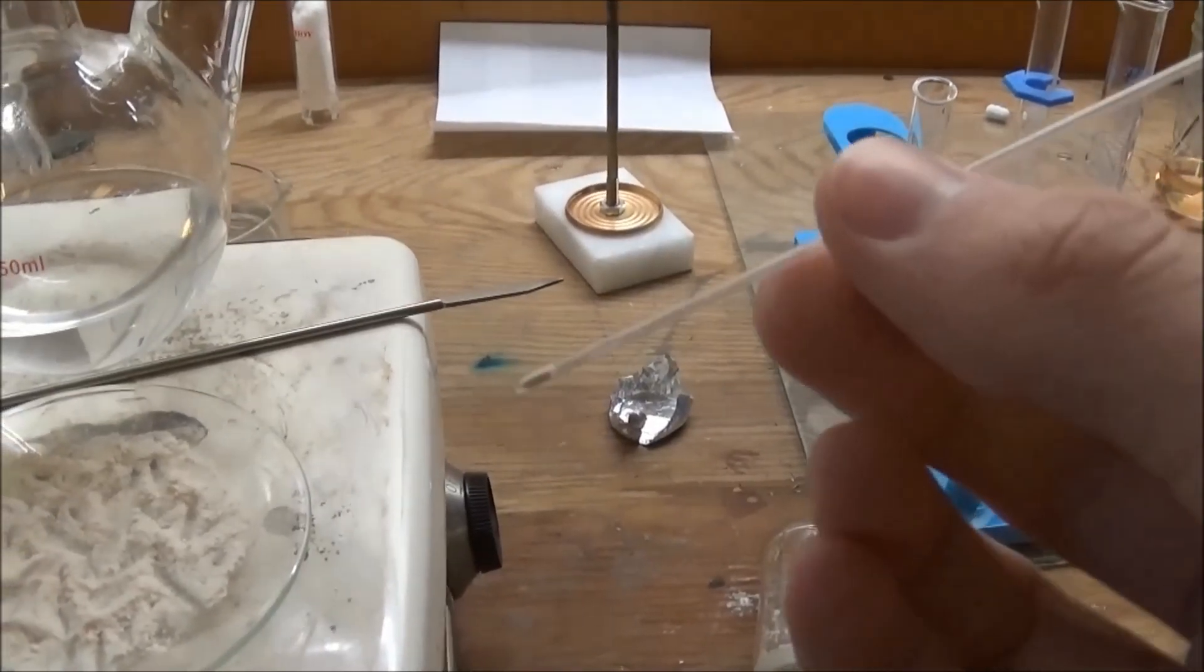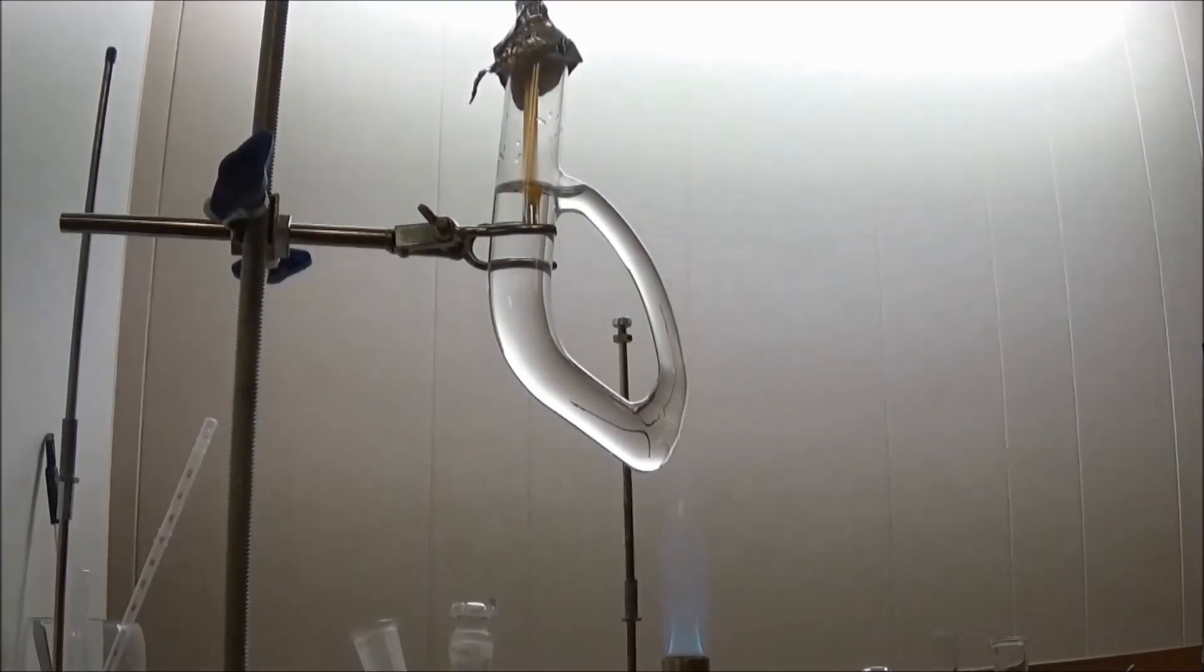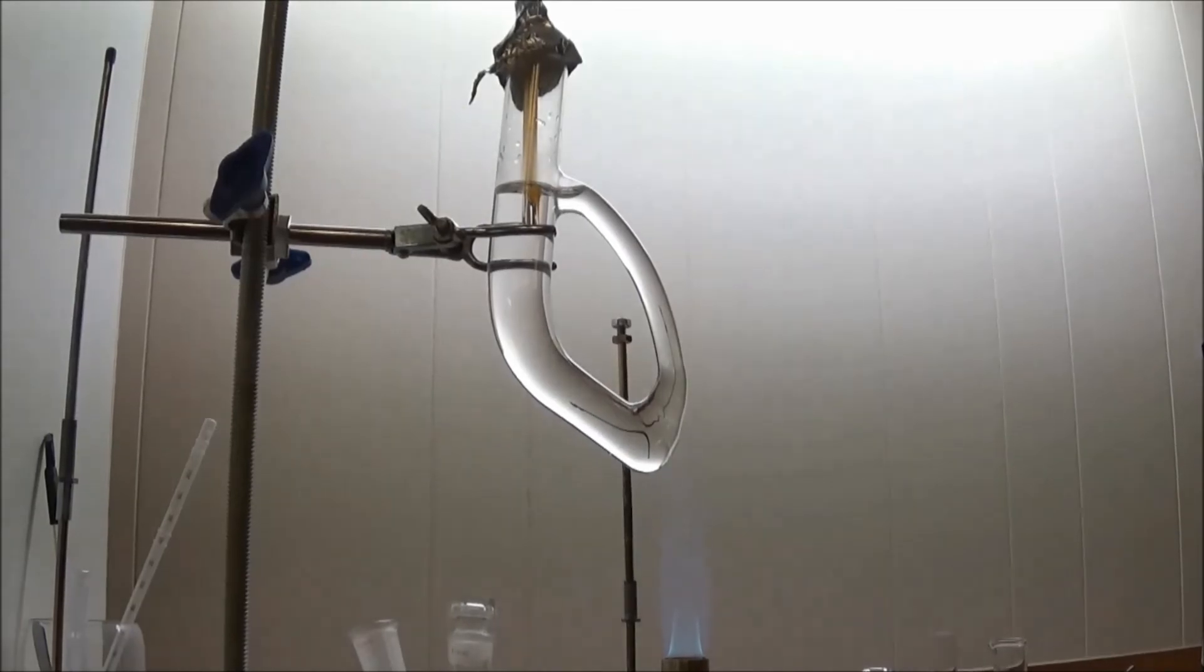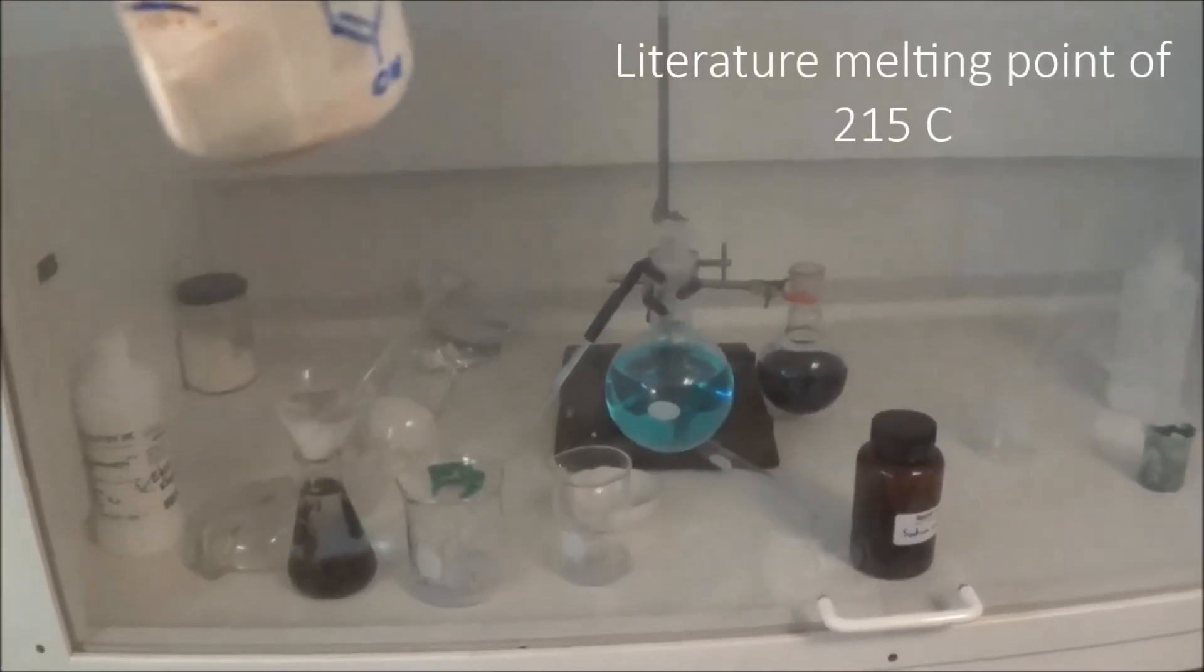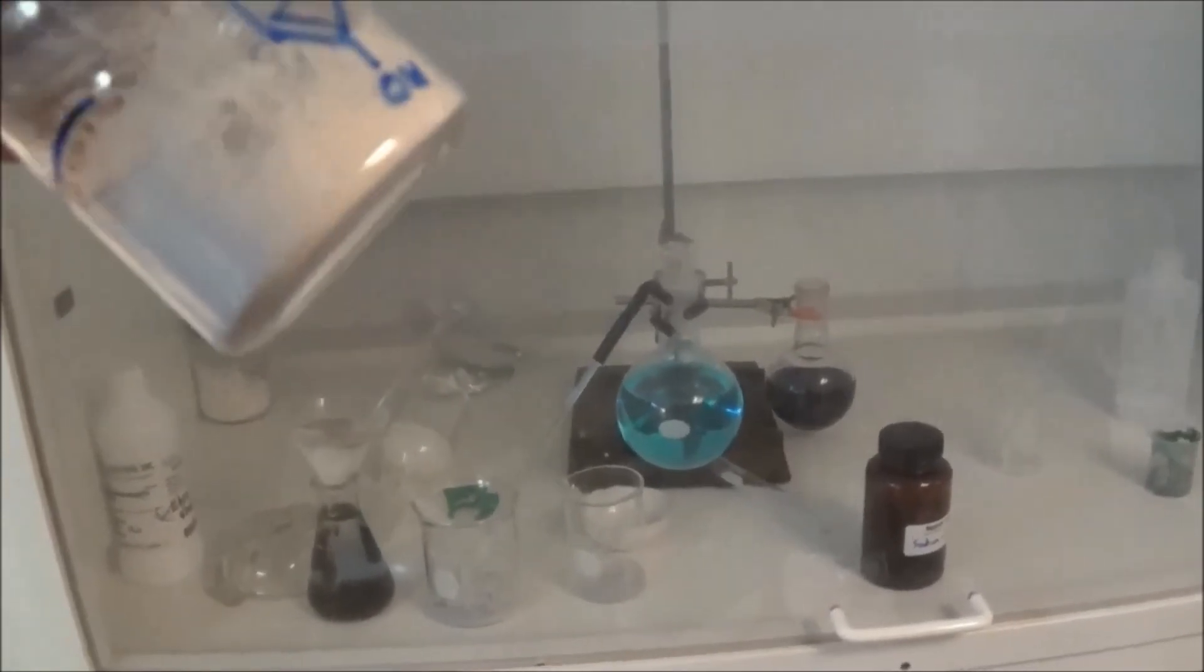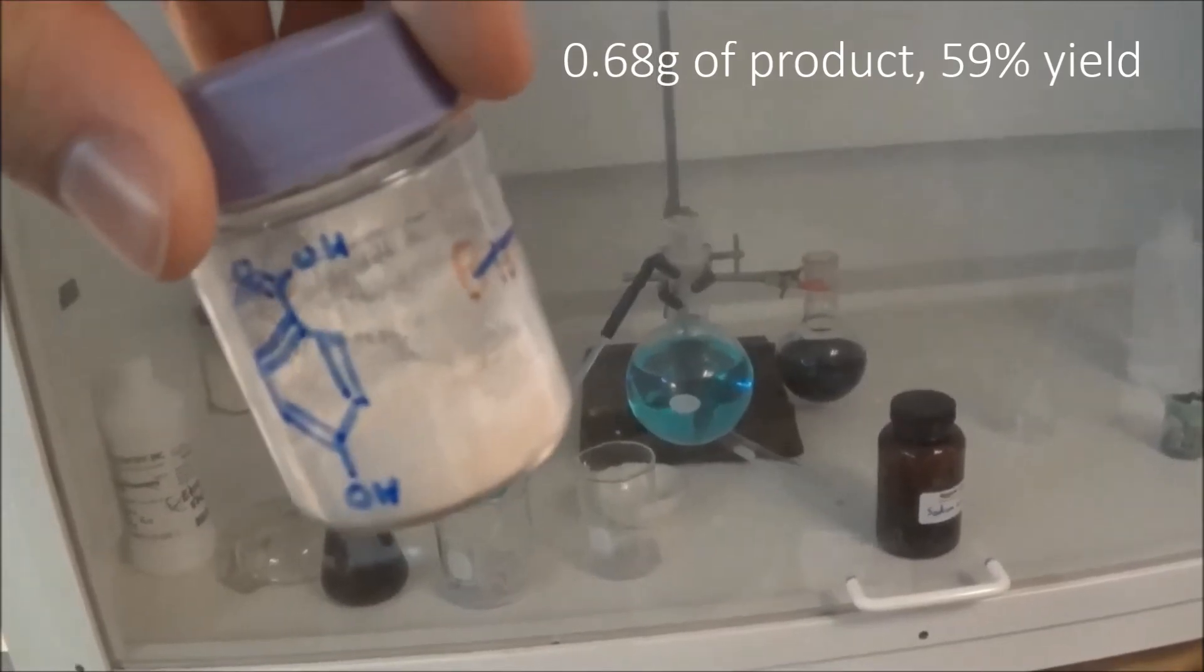I packed a bit into a capillary tube and took the melting point. I found the melting point to be about 205°C, which is a little bit low, but close enough that I can reasonably say this is 4-hydroxybenzoic acid.